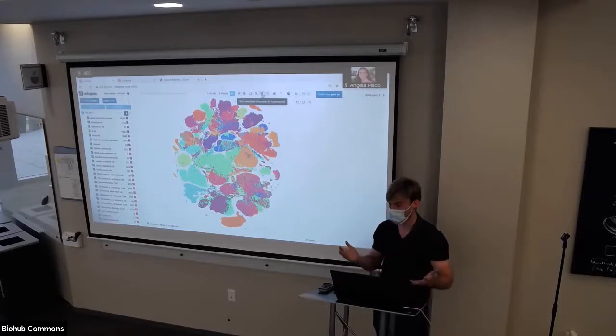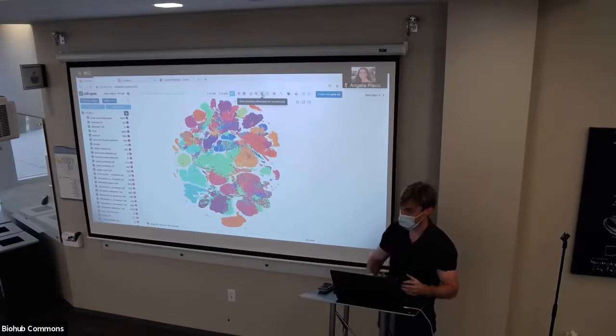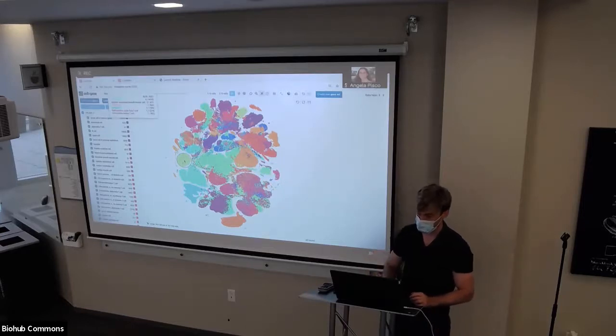I made an airplane because the name of the tool is LiDAR. It's kind of like a radius-based tool. And in keeping with it being a radius-based tool, when you click on it, you switch from lasso selection, and now around your mouse is this circle. Using your scroll wheel, you can make the circle bigger or smaller. You can point to a particular region of interest, make a circle whatever size you want, and then click. When you click on it, at the top left, you see this metadata show up.